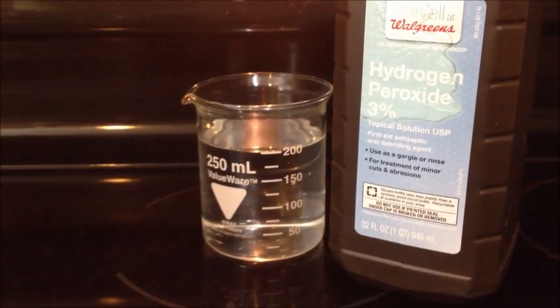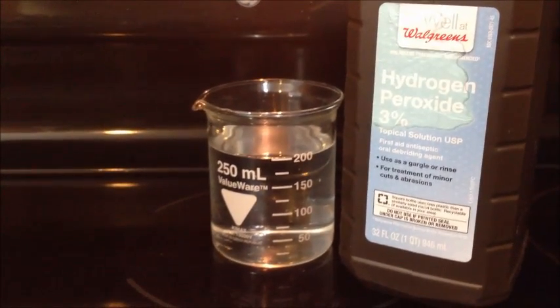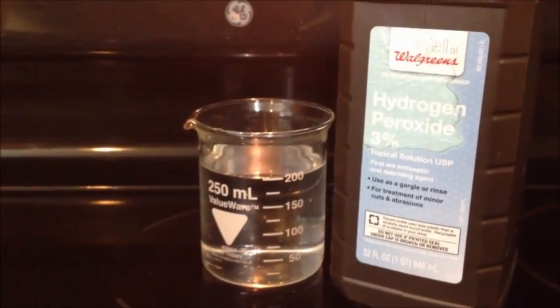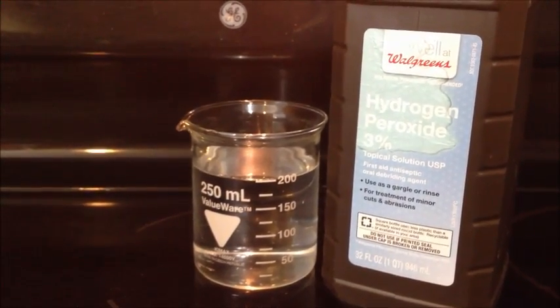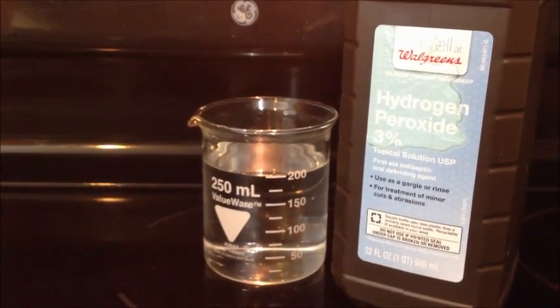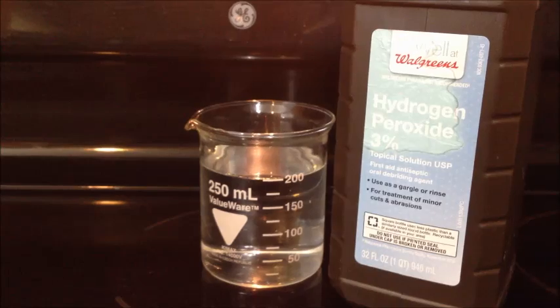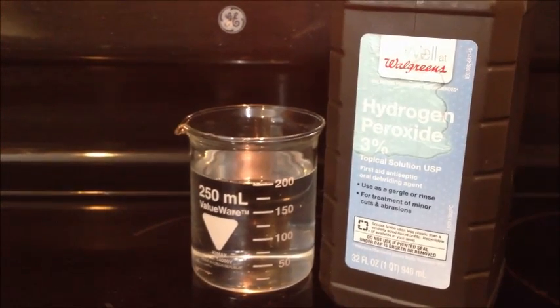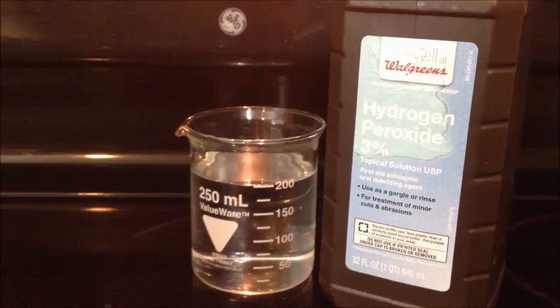Hey, what's going on? Today I'm going to be teaching you guys how to concentrate 3% hydrogen peroxide — the standard stuff you buy at the grocery store — up to 30%. Uses for this can be anything from bleaching your hair to making balms and everything in between, so later on you'll probably be figuring out what I use it for.